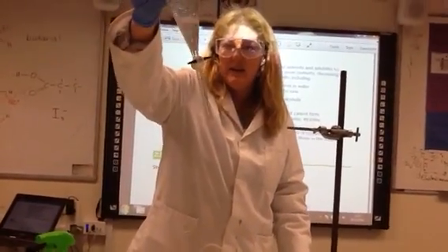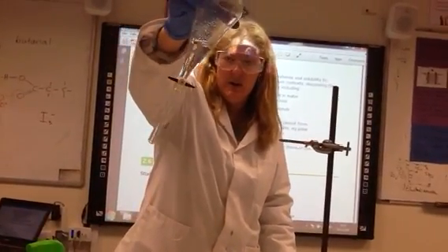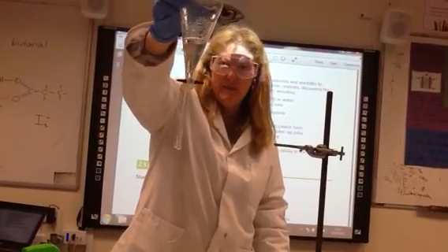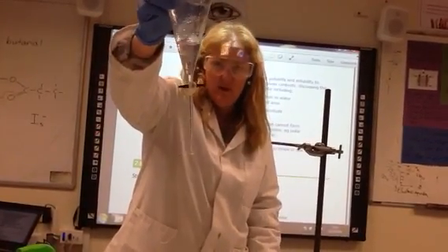So what you've got here is the hexane on the top and the water on the bottom. And you can see they're immiscible, so they're not mixing.